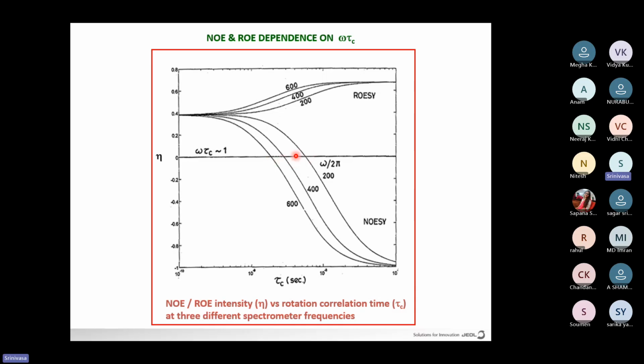That's very important. Sometimes if you are not getting an NOE peak or NOESY is not giving good data contours in your instrument, it's not only instrument issues, it may be because of the field dependent part. Maybe your molecule falls in these areas, so that's why you're not able to see it.